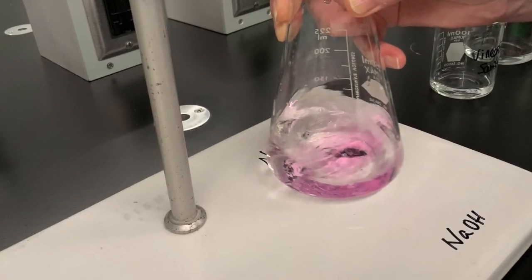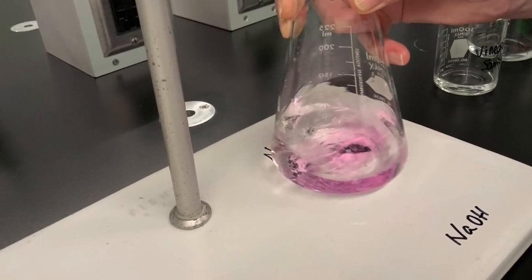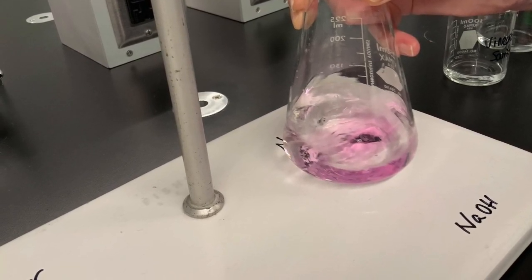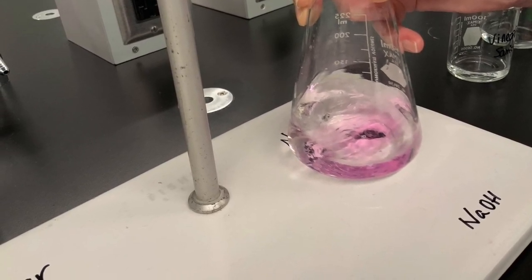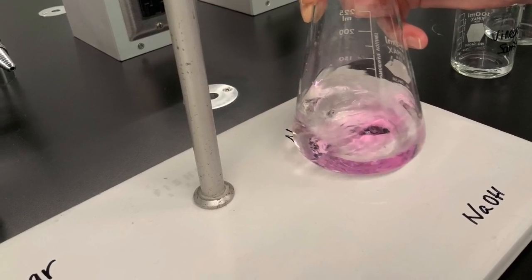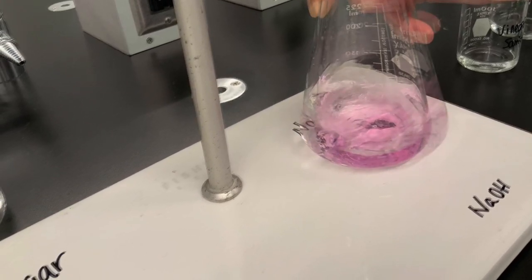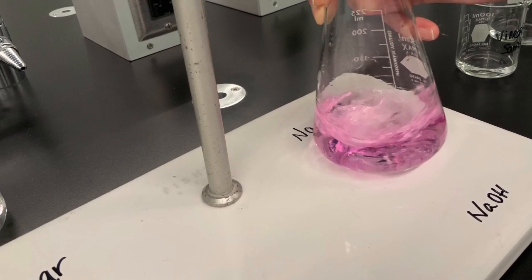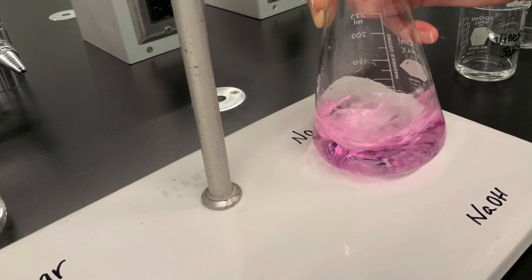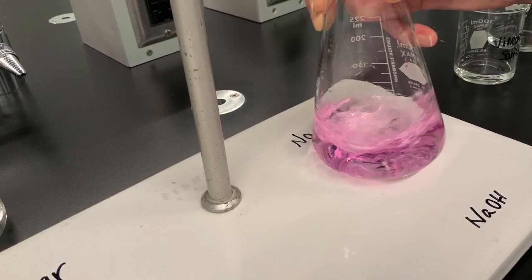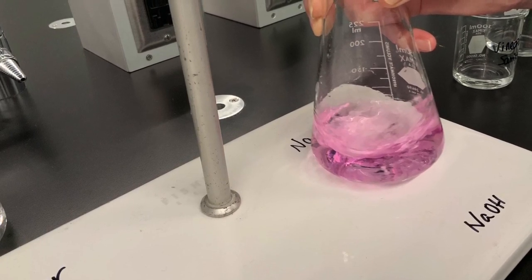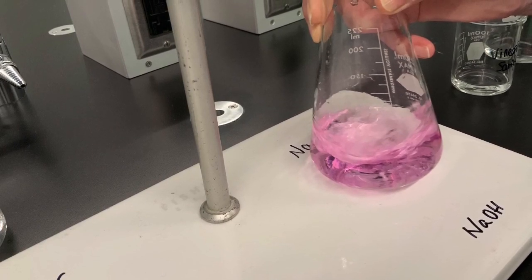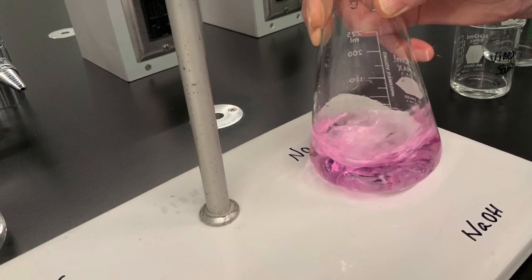For the last drops that are needed to turn the solution pink, you slow down the drop rate to maybe one drop every 5 seconds because you want to exactly determine which drop leads to the permanent pink coloration. Then you have a really exact measure of how much sodium hydroxide was needed to neutralize the acid, and then you can calculate the concentration of your acid based on the known concentration of your sodium hydroxide.